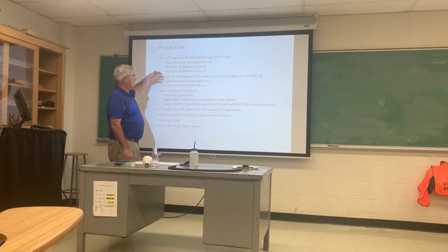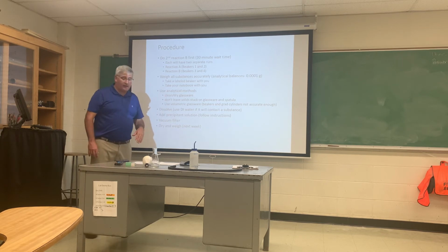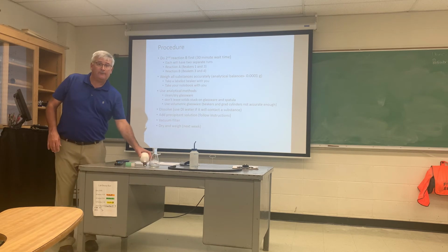All right. Be sure and use the analytical balances when you're weighing these, and keep enough significant figures, and always label everything. And we're going to do analytical methods. Now there's a new method that we're going to talk about today. It's on down here at the bottom. We're going to vacuum filter, and so there's a filter that we use.